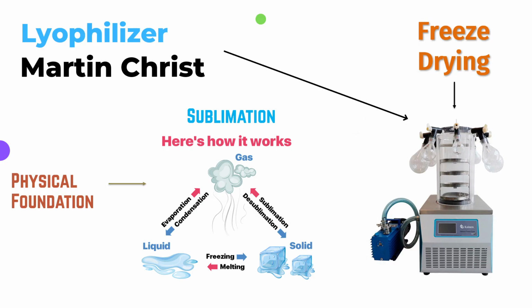So lyophilization is the process in which ice directly gets converted into gaseous form without getting converted into liquid form or state. What it actually means is it omits the conversion of solid into liquid and then gas. It directly converts the solid into gas, and this process of lyophilization is based on the physical foundation of a sublimation process. So the conversion of solid directly into gas is known as sublimation.